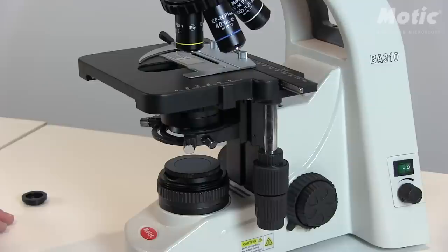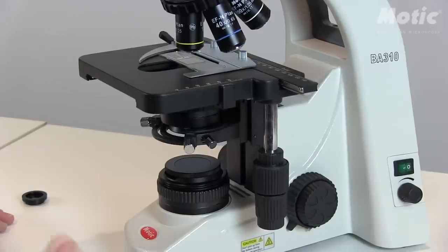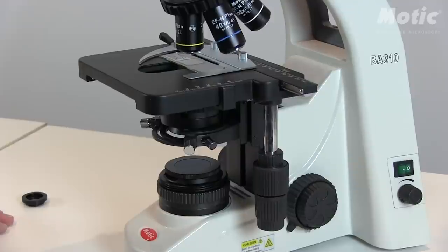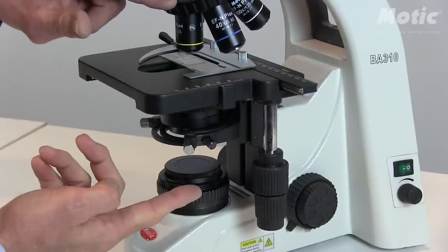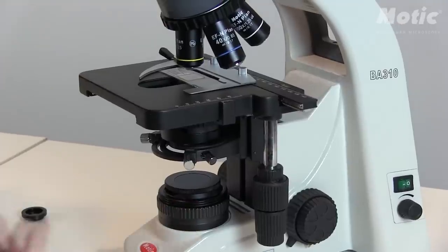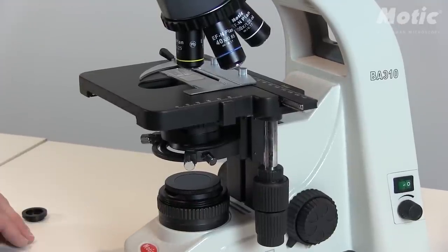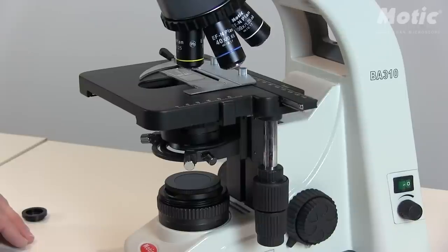Now, any birefringent structure will shine up as a bright structure or even colorful structure on this dark background. Please note that any strain component within the polarizer and analyzer area will lighten up the background. So it may not be perfectly dark, but only dark grayish.